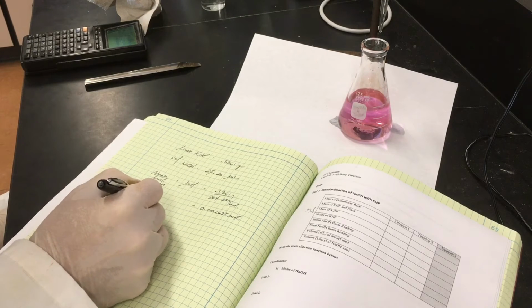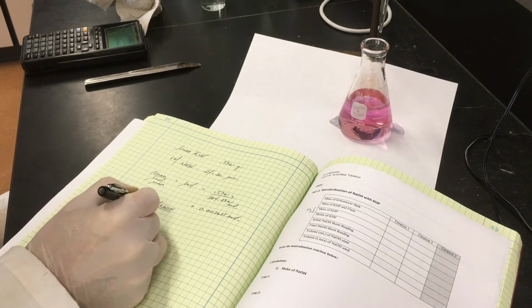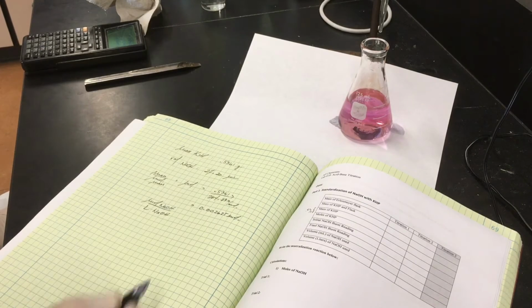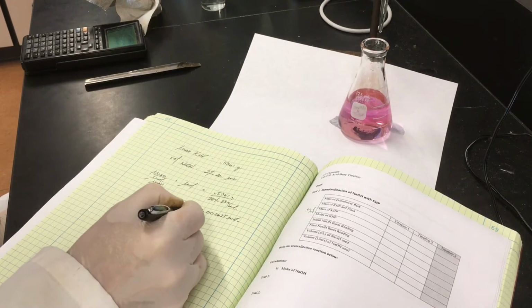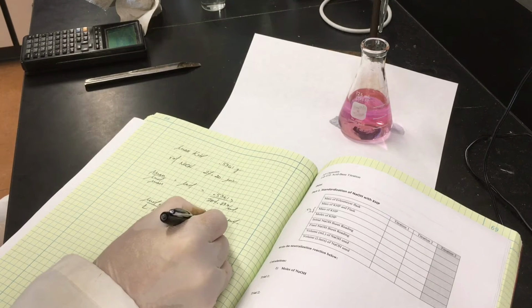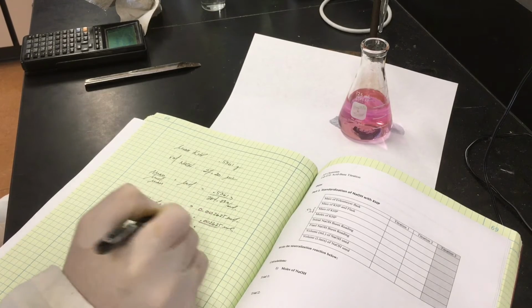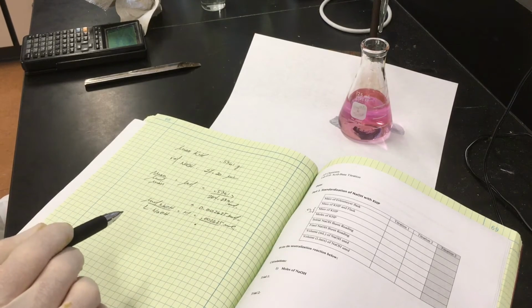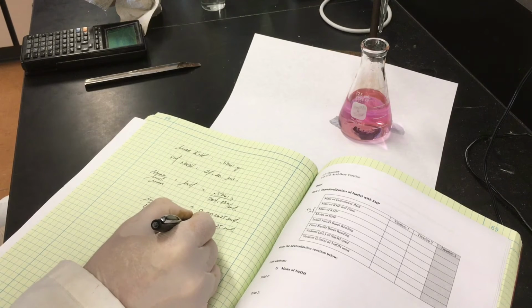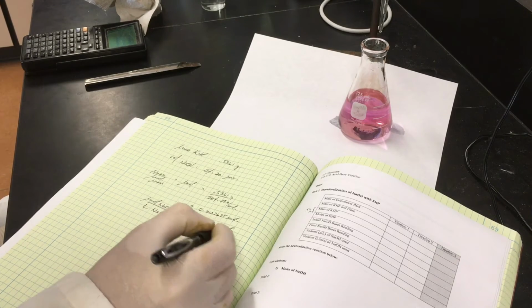So therefore we can get the moles of NaOH divided by the liters of NaOH that we used, and that's going to give us the concentration. So we could use 0.002625 moles divided by, and since we used 27.2 milliliters, in liters it's 0.0272 liters.